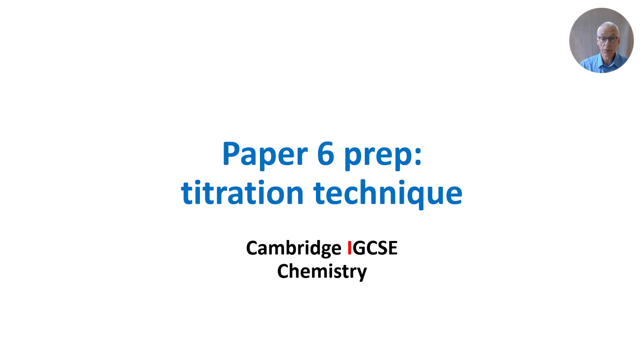Cambridge IGCSE chemistry, paper 6 preparation, titration technique.